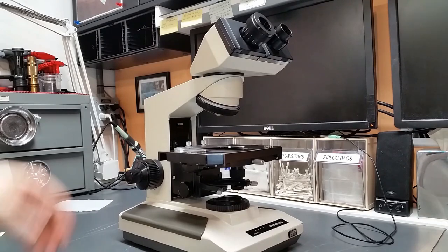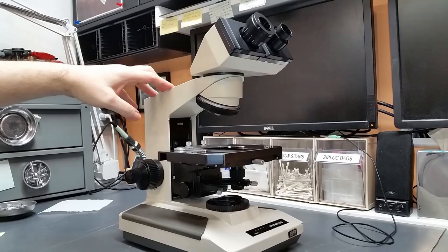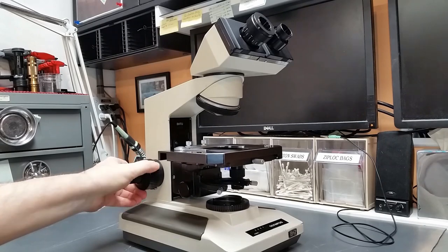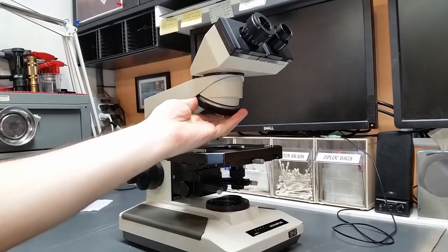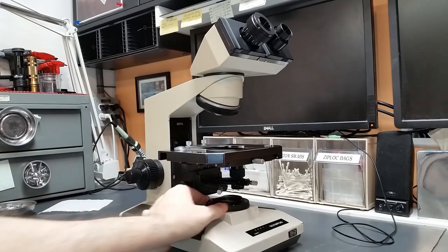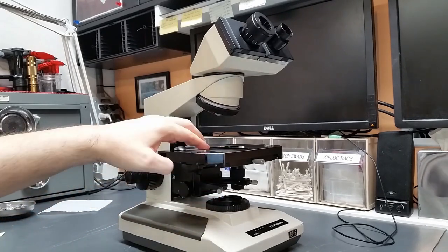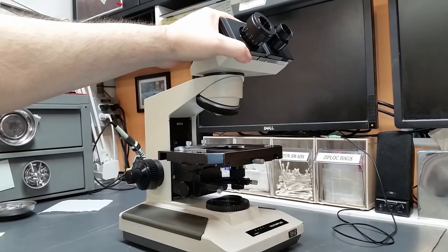Hello, welcome to Part 7 of my series on servicing an Olympus BHTU microscope. If you've been following along: Part 1 was the focus block, Part 2 was the coaxial focus mechanism, Part 3 was the nose piece, Part 4 was the substage illumination, Part 5 was the substage assembly, Part 6 was the stage specimen clip. And today in Part 7, I'm going to do a little bit of work on the binocular head.